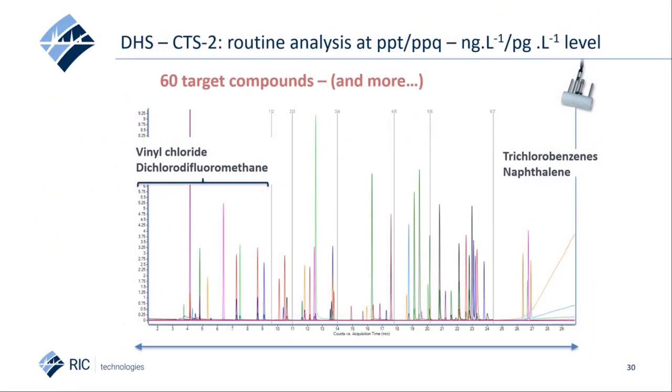This results in a complete and very sensitive analysis of the typical VOC compounds, where the very volatiles are refocused perfectly, resulting in very sharp peaks, and an overall impressive sensitivity for all volatile compounds when sufficiently present in the headspace. Nanogram per liter down to picogram per liter concentration levels can be reached. One set of DHS TDU PTV parameters deliver a total VOC profile using a carbon-based high-capacity adsorbent trap. A cryostat cooling temperature of -40 degrees is sufficient to trap the volatiles, considering a correctly made on-column capillary trapping setup.